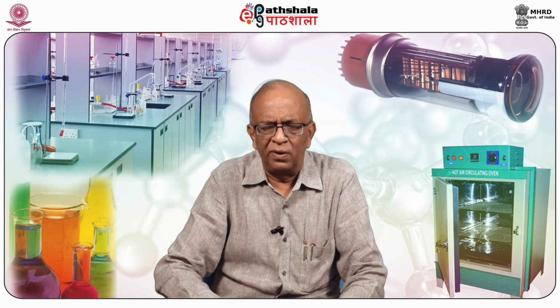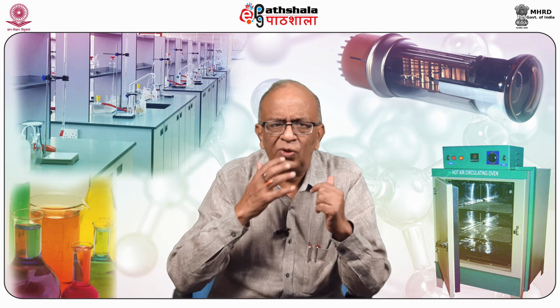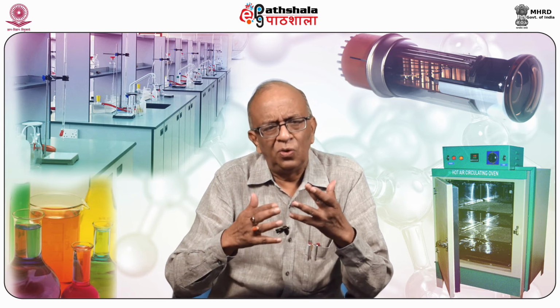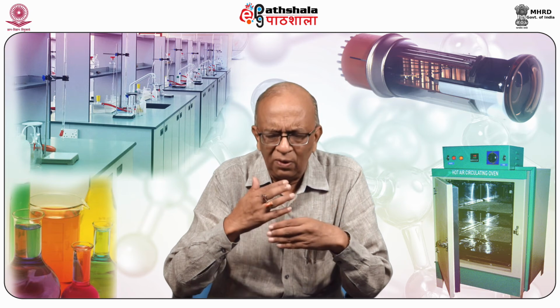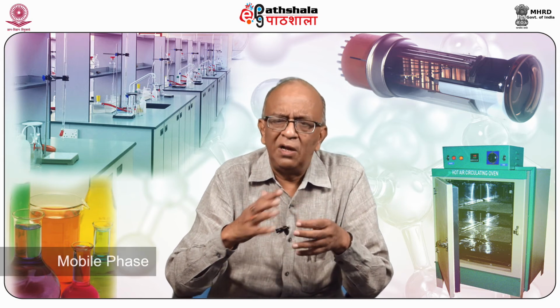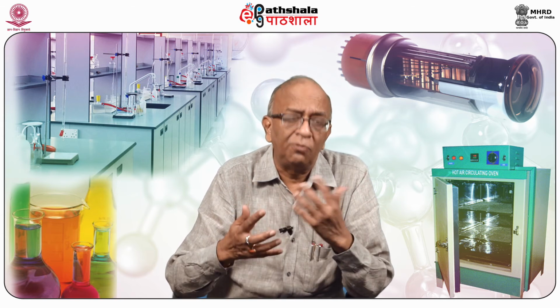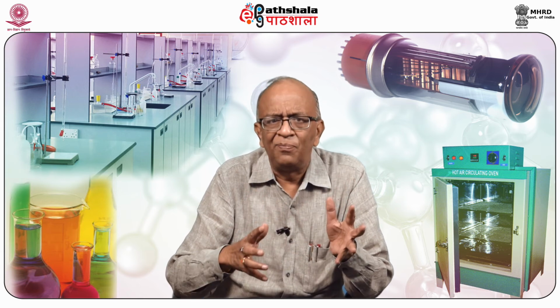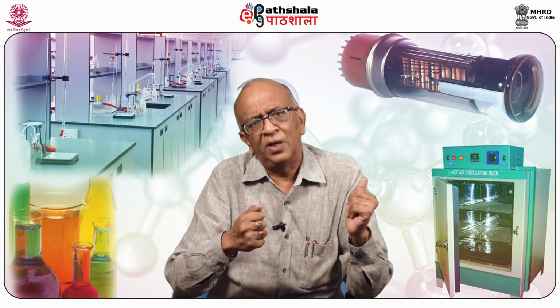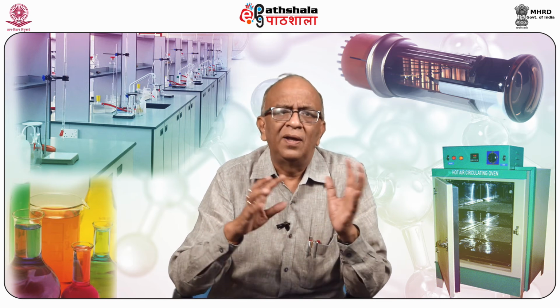In gas liquid chromatography, the stationary phase is a liquid phase, and this liquid phase is supported on a solid surface, and the mobile phase is a gas. So we have chances of manipulation, as thousands of different types of liquid phases are available, but the mobile phase is usually a gas. By taking a suitable liquid phase, which liquid phase should be suitable? It should not react with the components of the substance which we are separating. Means it should be unreactive to the components of the mixture which we are separating.